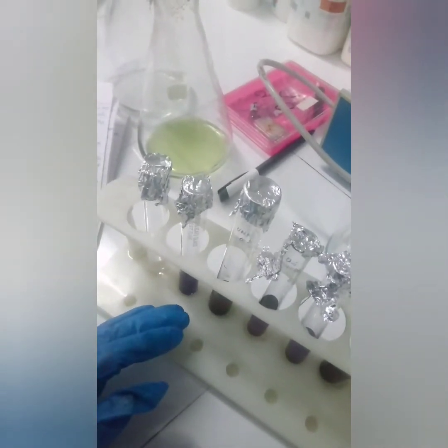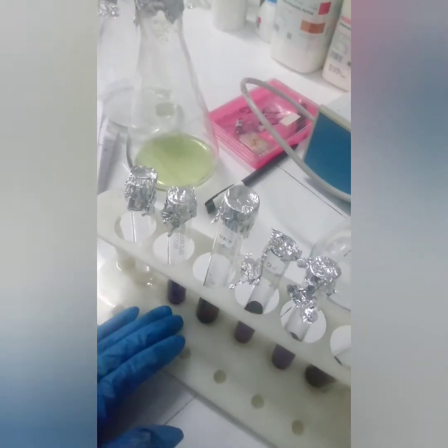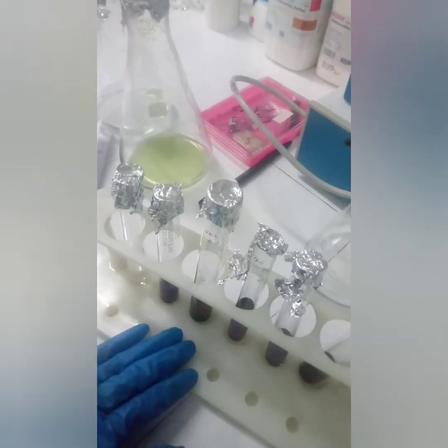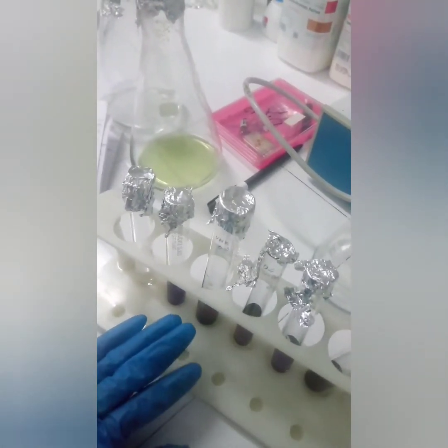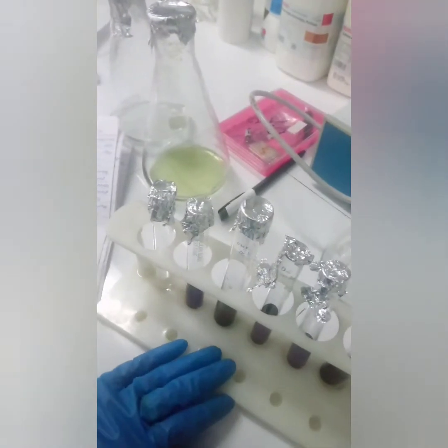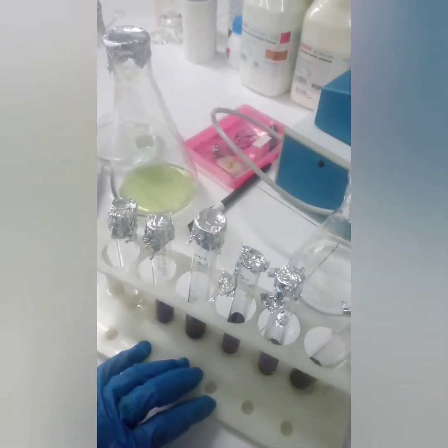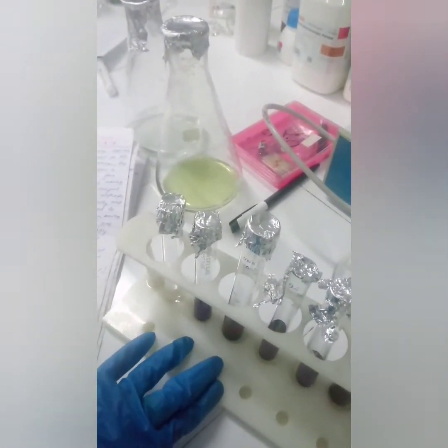Here the primary amino groups react with Ninhydrin to form the purple color dye known as Ruhemann's purple, which was described by Ruhemann in the year 1910. We had already discussed this in the theory. Just remember the principle: Ninhydrin reacts with the free amino acid.